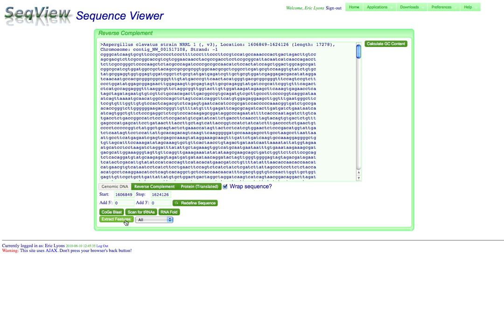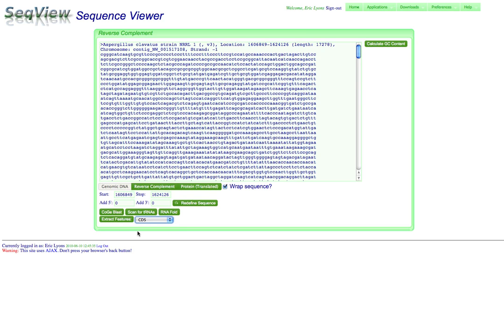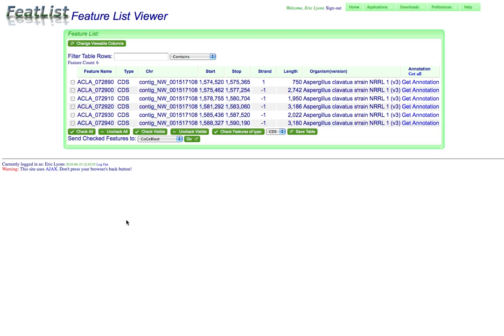This tool has an option called Extract Features. So, for example, if I'm interested in just getting all the protein coding sequence, I can select CDS and click Extract Features.